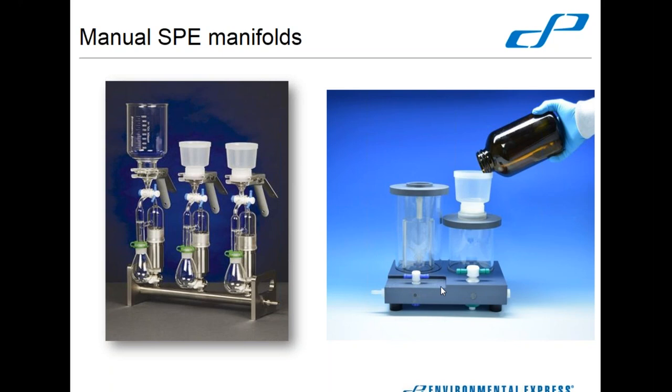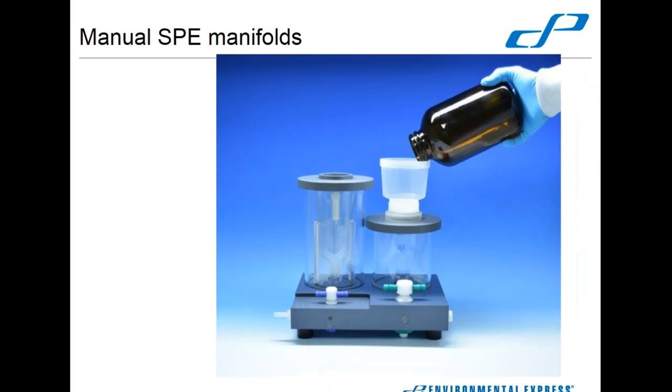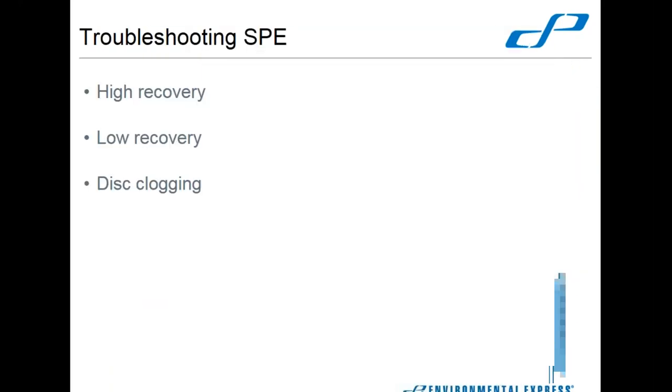One thing we need to make you aware of is that space-wise, these only come as single stations. They do take up a little bit more space than the compact style available from the glass setup. This three-position station that you're looking at here is just a little bit wider from side to side than this single position station. However, they're not quite as tall, so it's a little bit easier to stack them up front to back on your benchtop. You lose a little bit of space, but we believe the functionality more than makes up for losing that space.